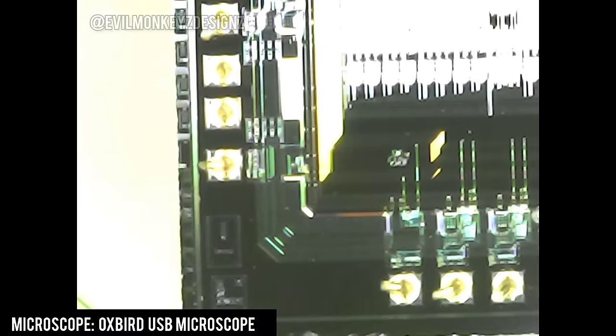One thing different about this photo sensor is that the part number is cut out of one of the upper layers, allowing a clearer view of the circuits underneath. Shifting over to the pixel array we can zoom in and get a closer look at the individual pixels, though we are still limited by distortion. According to the datasheet each pixel is 3.4x3.4 micrometers square. Zooming back out, the actual focusing mechanism is identical to the first two microscopes. At the end of the day it's essentially the same microscope with a slightly different sensor and a monitor attached, though there is still a resolution discrepancy: even though the sensor should only be 0.3 megapixels maximum, Windows reports it as 0.9, and the Amazon listing lists it as 8 megapixels.